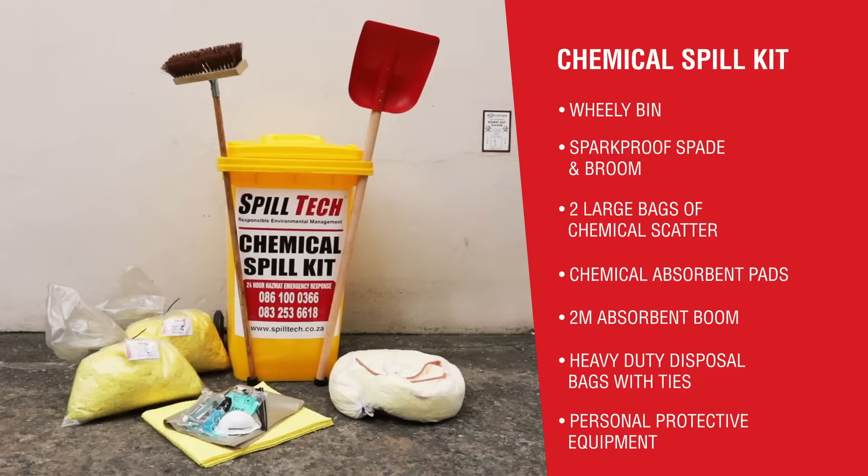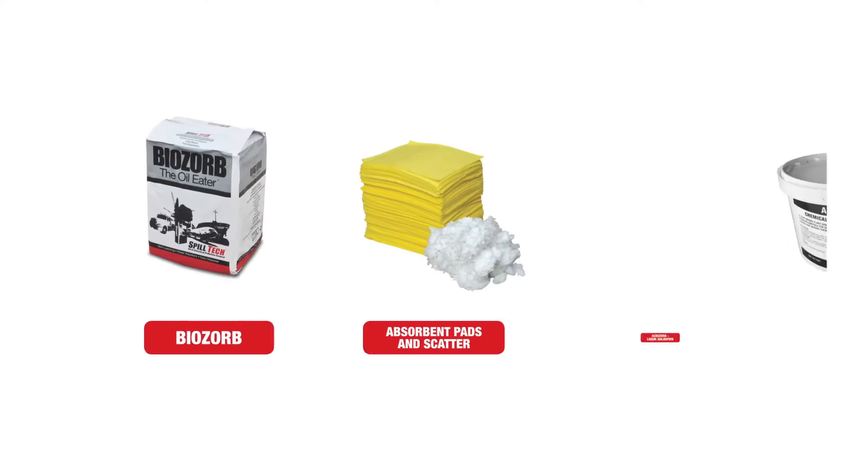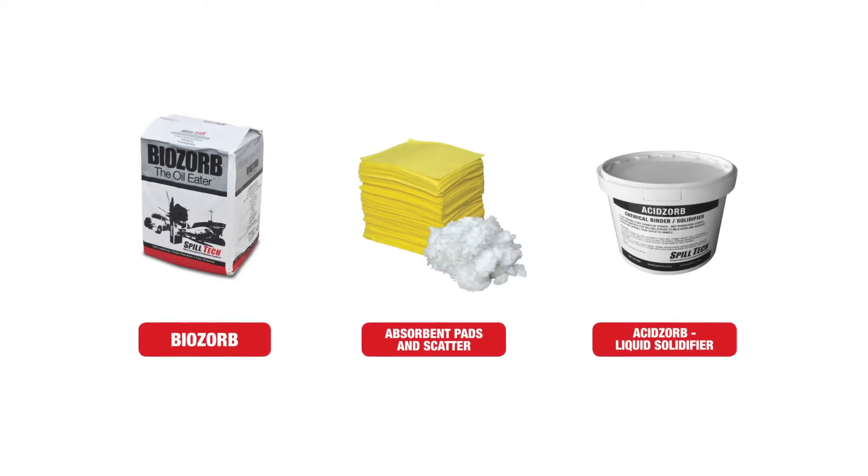Depending on the product that has been spilled and the industry concerned, there may be alternative products required. Spilltech will assist you to customize your spill kit to suit your industry.